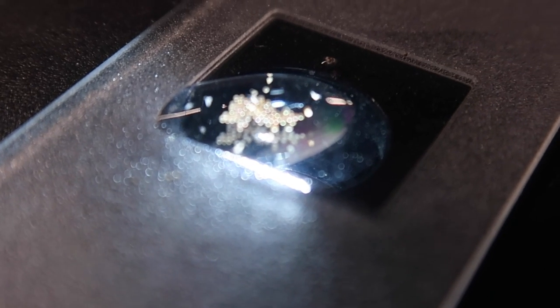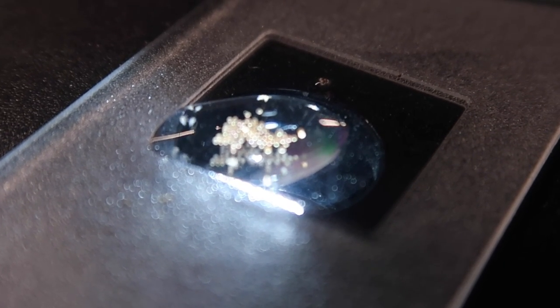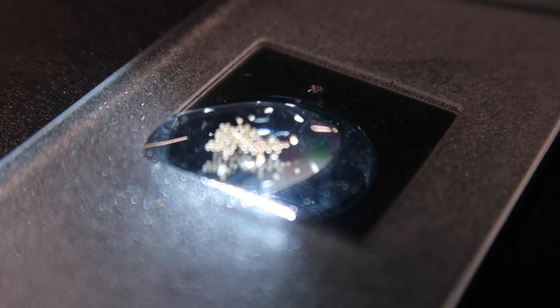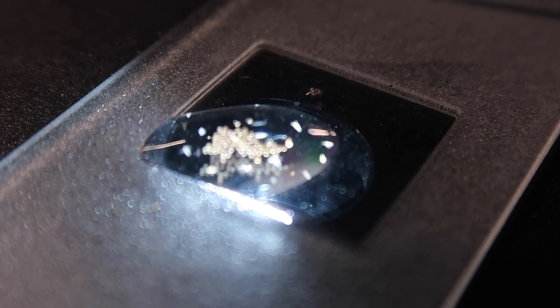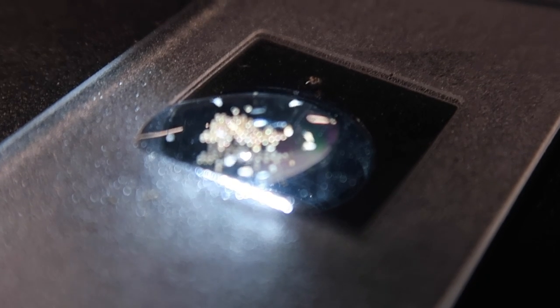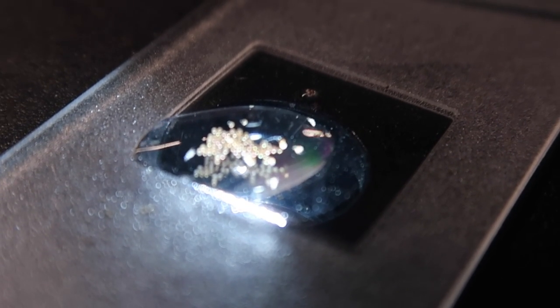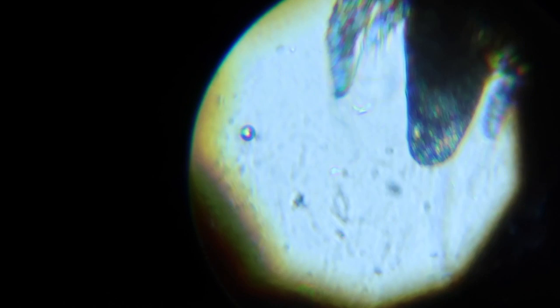So now we have some live brine shrimp. They're very hard to photograph through the microscope because of the very small field of view, and you can see a lot of them swimming around in there. And finally I managed to get a shot of them in the microscope. They look great. They don't stay in the viewfinder for very long, but you can clearly see them swimming about.